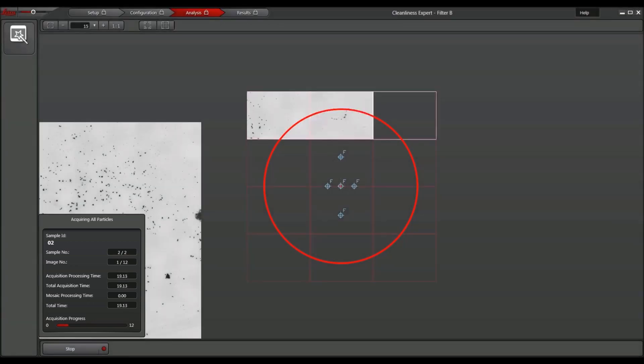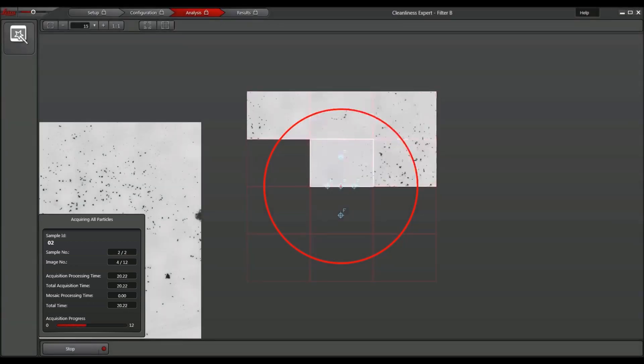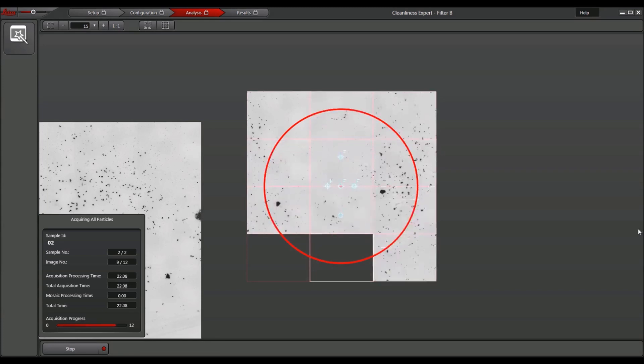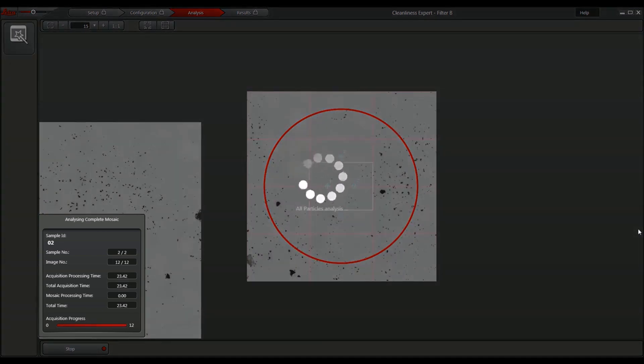After the analysis takes place and the results are available, the software switches automatically to the result workflow.